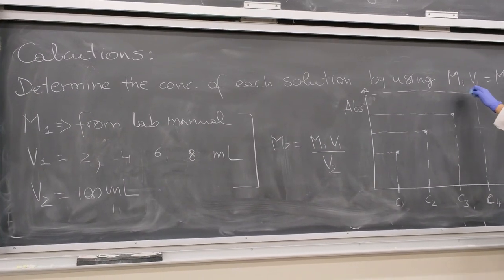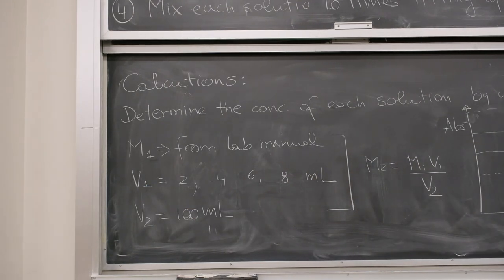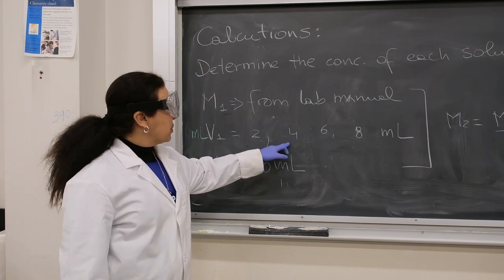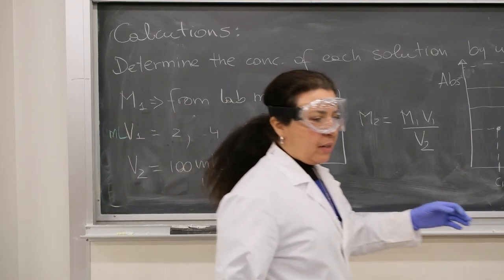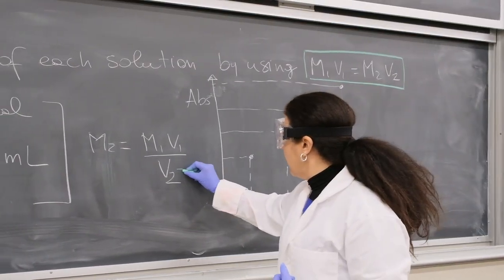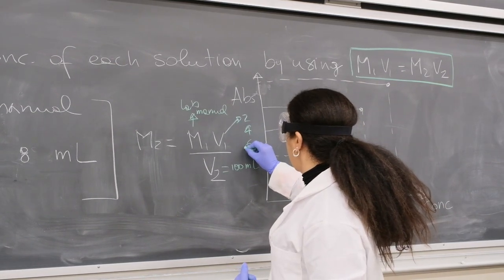So first we figure out, using M1V1 equals M2V2, the concentration of each solution. M1 is the concentration of Allura red that you find either in the bottle or in the manual. V1 is the volume, in milliliters, of solution that you took from the bottle, so 2, 4, 6, and 8 milliliters. V2 is the final volume at which you diluted your solution, so it's always 100 milliliters. M2, which is what we want to find, equals M1V1 over V2, where V2 is 100 milliliters. M1 is from the lab manual, and V1 is once 2, then 4, then 6, then 8 milliliters.